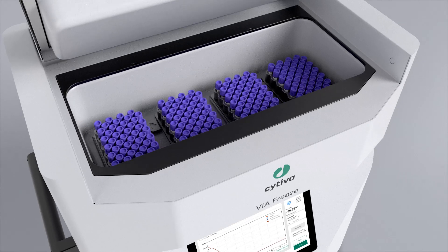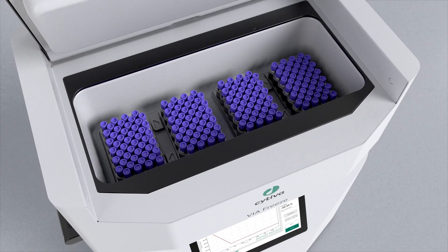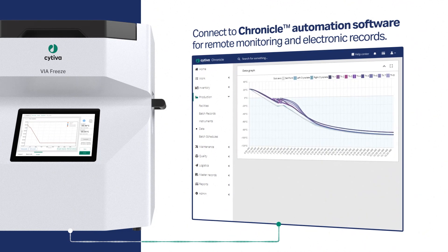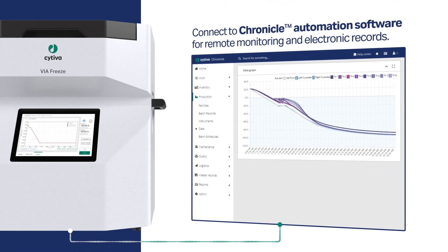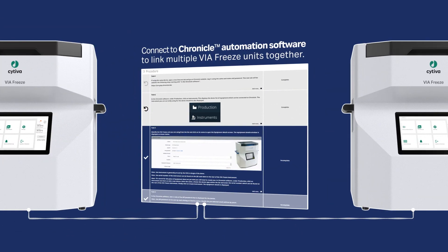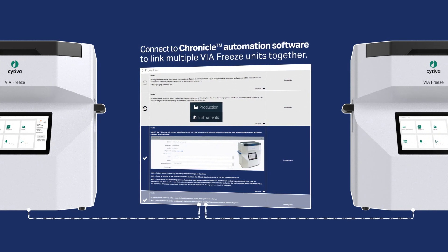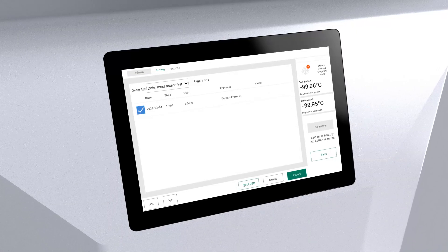Once your process is complete, your samples are ready for transfer to long-term cryogenic storage. Connect your ViaFreeze instrument to Chronicle automation software to enable remote monitoring and electronic records, or to link multiple ViaFreeze units together. Alternately, you can also collect data from the instrument using the USB port.